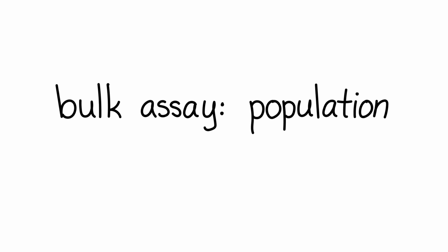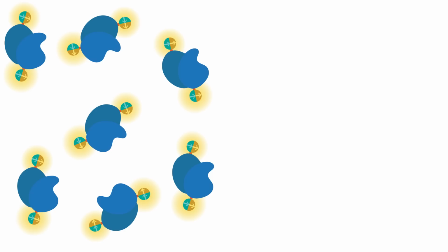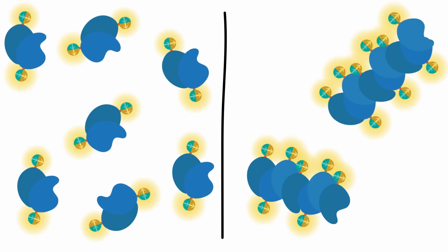Think about this. Could you theoretically have the same pyrene fluorescence if you had many short filaments, for example, via nucleation, or if you had a few long filaments? Yes, details such as the length of the filaments or how fast individual ends of the filament elongate are not resolved with the pyrene-actin assay. But you can still get a good idea about how a protein influences actin polymerization overall.